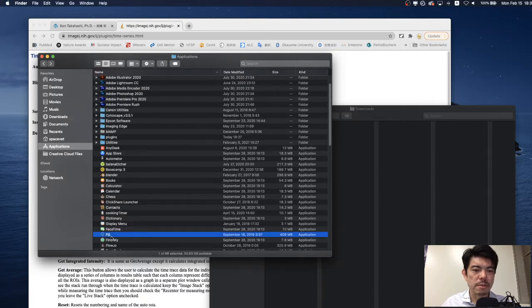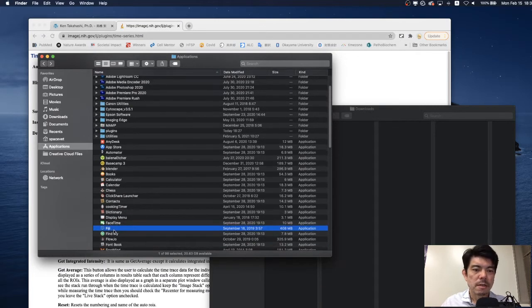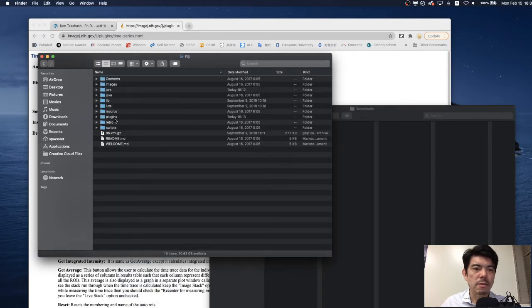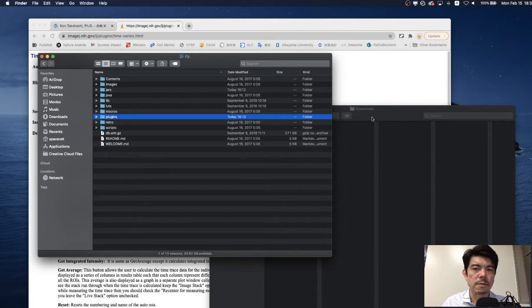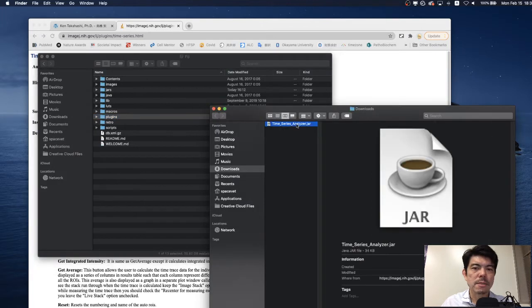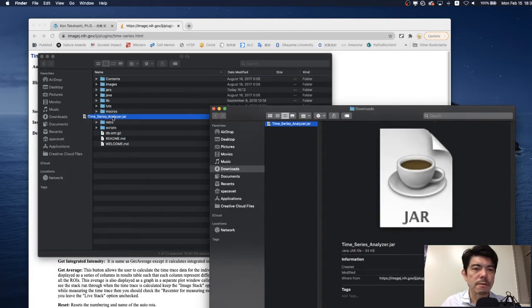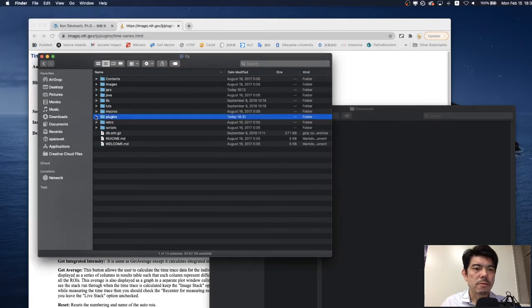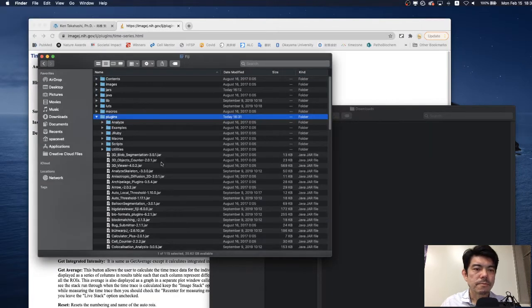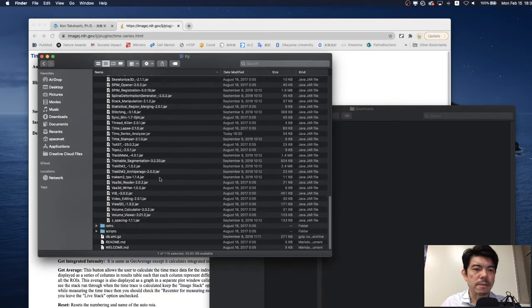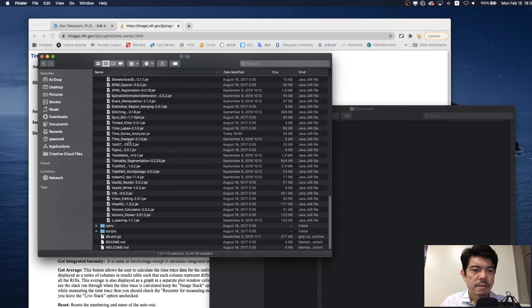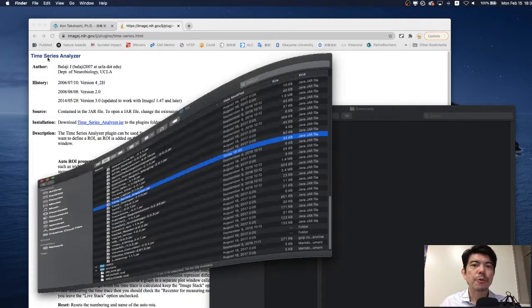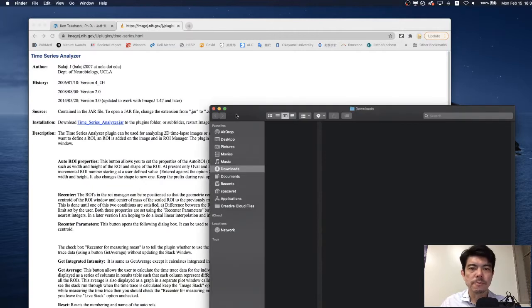This is Mac but Windows has similar folder for ImageJ. Fiji is the upgraded version of ImageJ. We open this folder and here you can find plugin folder. I move this downloaded file to plugin folder and you can find the Time Series Analyzer.jar which we downloaded. Now we are ready to open ImageJ.